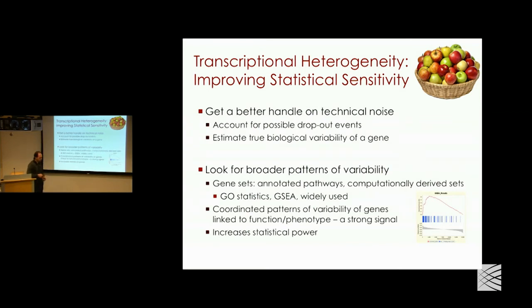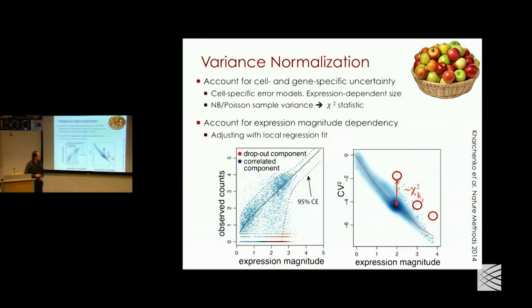So the idea here was pretty much the same. If you have a heterogeneous population of cells, and in some subset you see all of a sudden these actin genes all go up, that tells you two things: that most likely there is a real, distinguished subpopulation, and it's probably distinguished in part by the actin pathway activity.